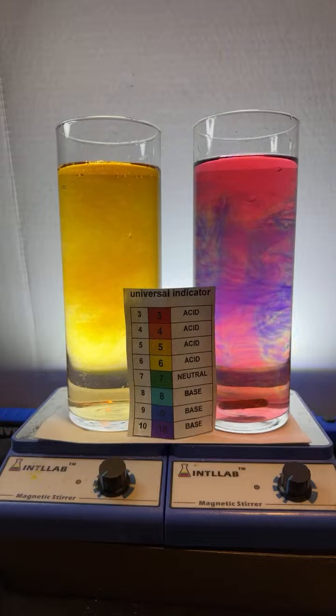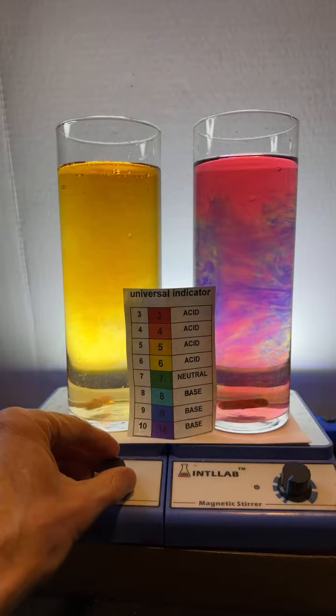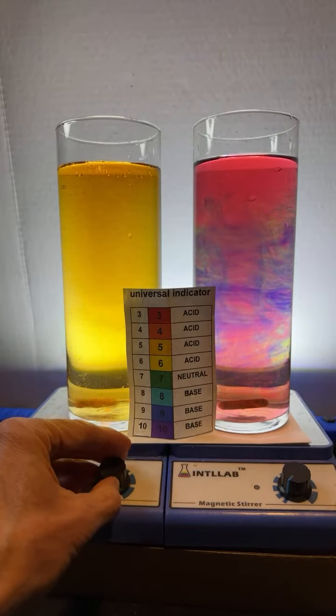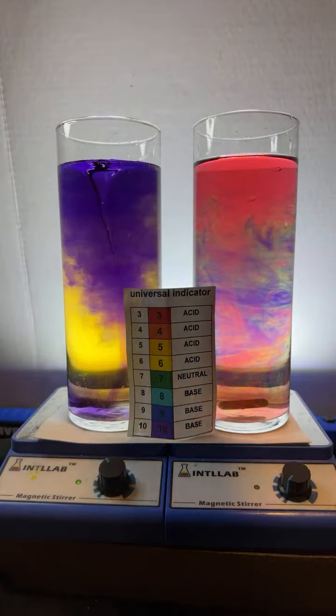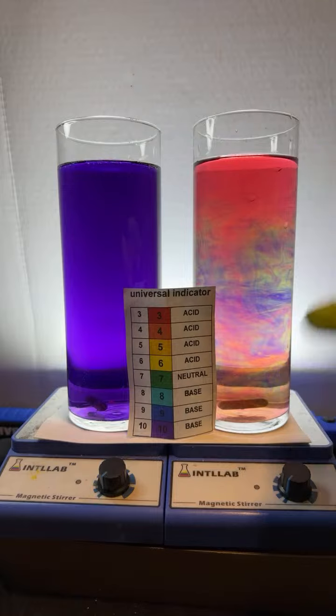I probably should put a stir bar in here to just get that mixed up. Get that going. Get the colors mixed up. And I'm going to make it basic. All right, that's nice and purple. Look at those beautiful colors over here. It's like the chemical northern lights.